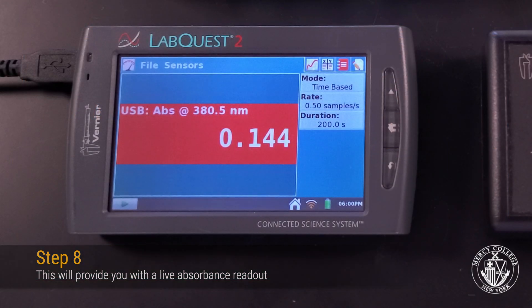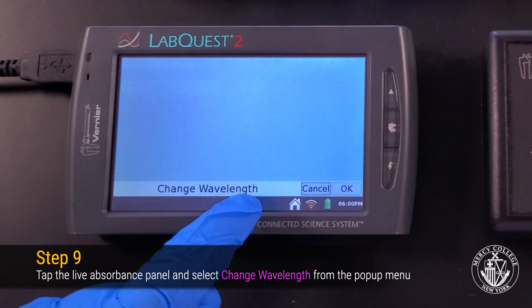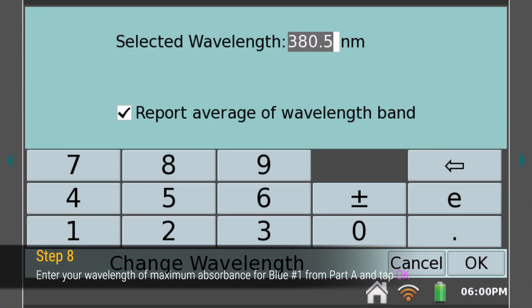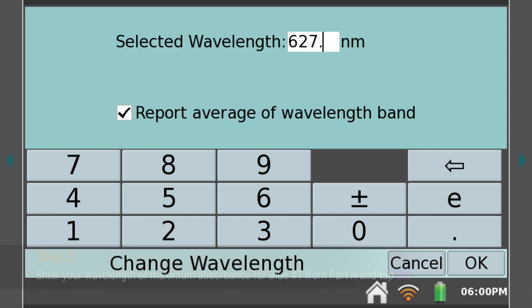Now tap the absorbance panel and select Change Wavelength. To analyze the amount of blue 1 dye in each of our samples, we need to set the wavelength to the lambda max wavelength for blue 1 from Part A of the experiment.